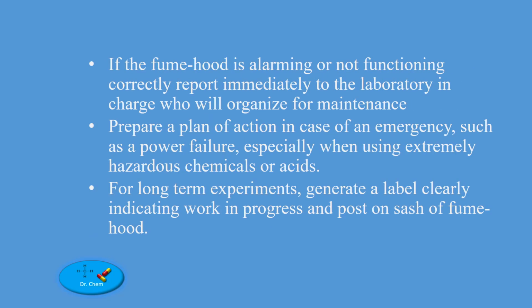If the fume hood is alarming or not functioning correctly, report immediately to the laboratory in charge, who will organize for maintenance. Have an emergency plan in place in cases such as a power failure when handling extremely hazardous chemicals or acids. For long-term experiments, generate a label clearly indicating work in progress and post it on the sash of a fume hood.